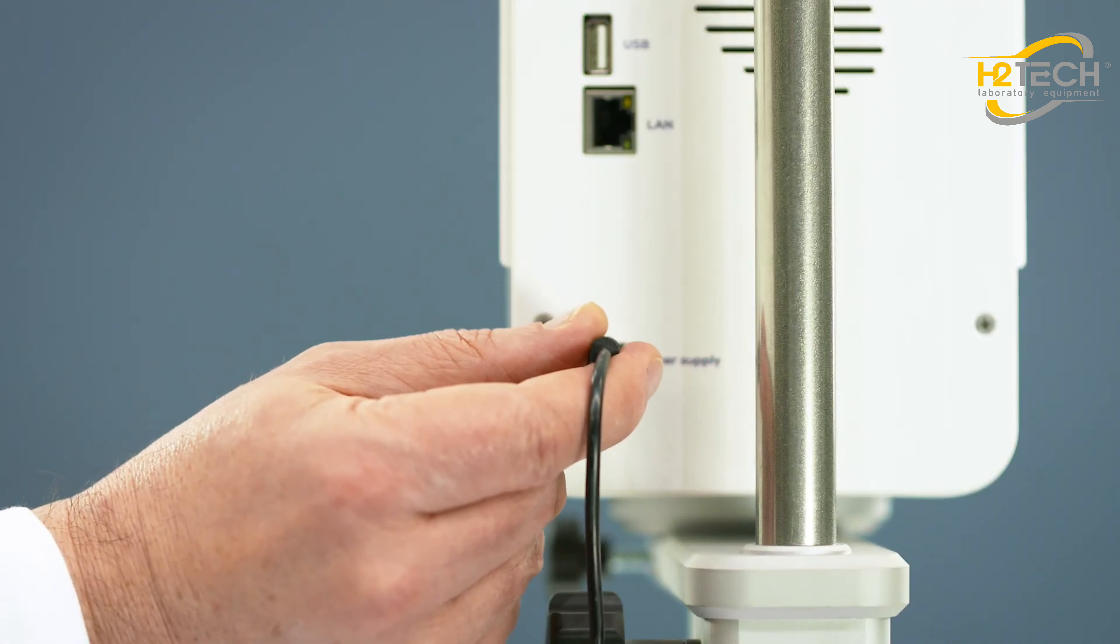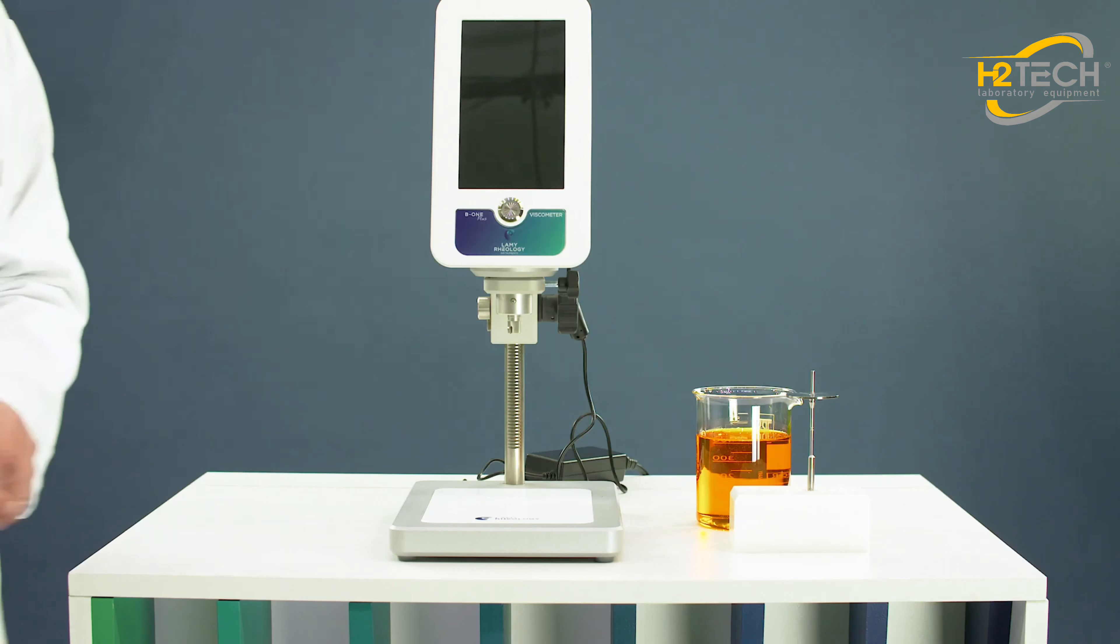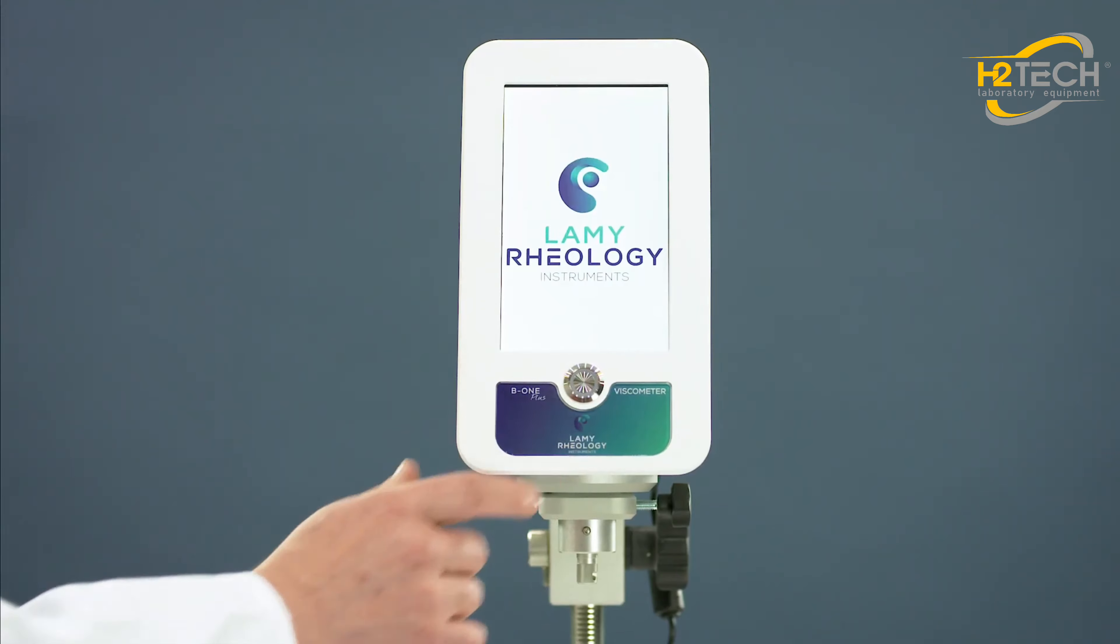Plug the power supply on rear panel of the device. Switch on the B1 Plus.